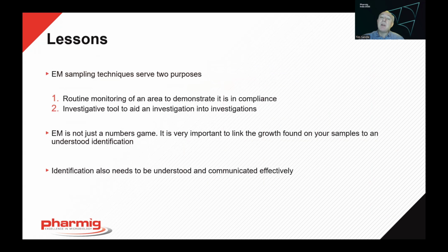And there were some lessons as well. Environmental monitoring is limited. We need to emphasise the control. There's an array of different microorganisms out there, and if we're not in control, these can be readily transferred into the area. So we do need to be careful of that.